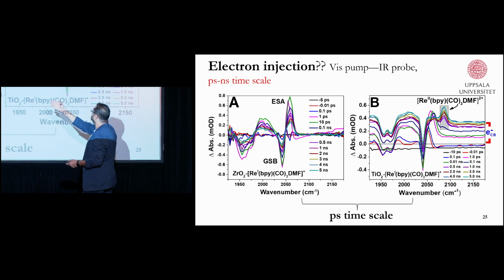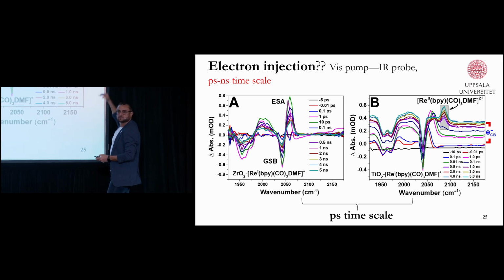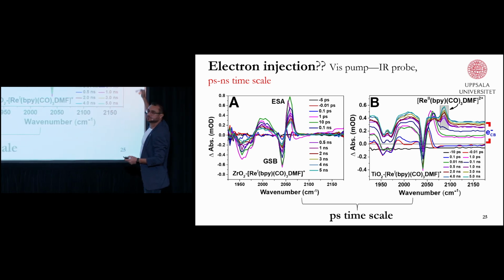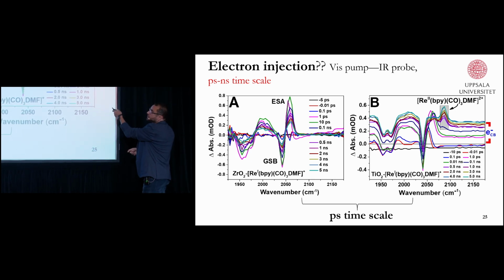And the spectra look similar, except, first, the offset. Here we are in the near-IR, mid-IR range, right? So we have the offset, which tells us something, I will explain now. Plus this beautiful, tiny new feature, which is not here. We have only the bleaching, but we have this one and this one.